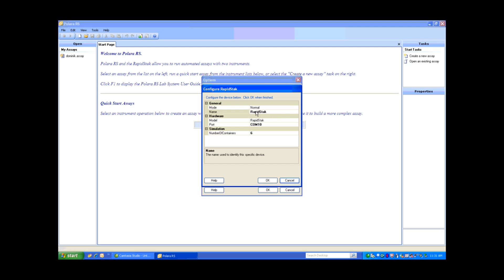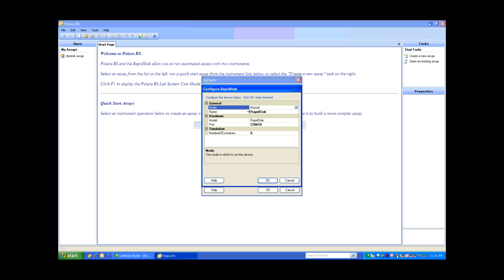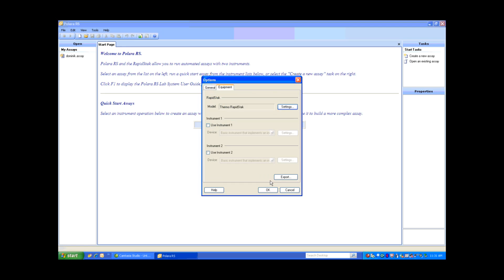Let's just view the settings. I have it set to Normal. We also have a Simulation mode for when you're not connected to the RapidStack, but I am connected, so we're going to keep it at Normal. I've given my RapidStack the name 'RapidStack', and I know that it's on Comport 10, which is important. I'm going to select OK.